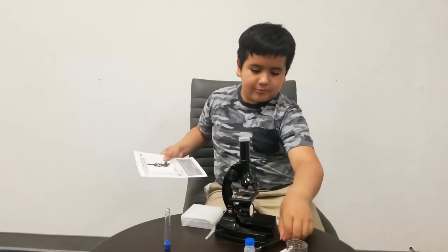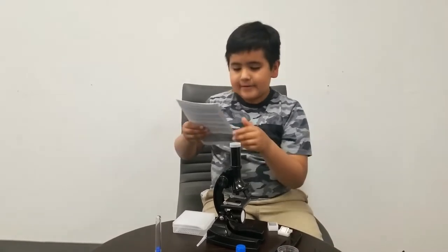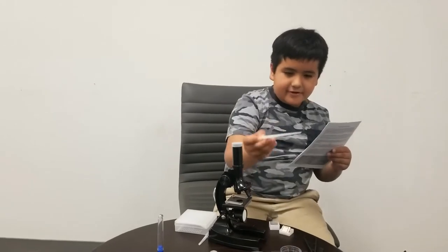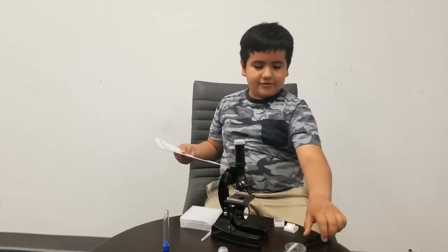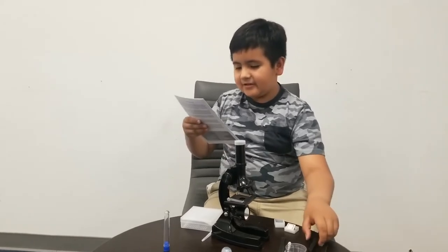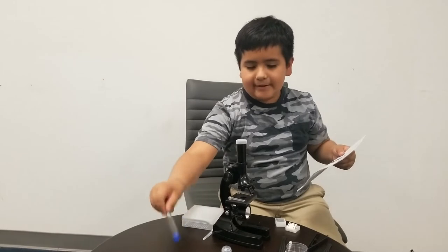One scalpel, which is this thing. One spatula, which is this thing. And a stirring rod, which I believe is this. And one tweezers, which is this, I think. And a test tube with cap — I think this is it.